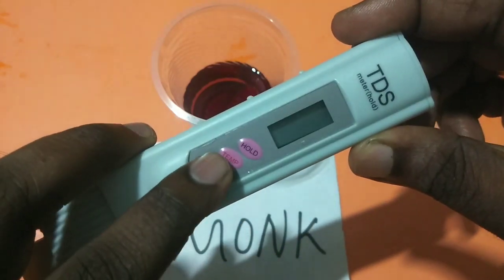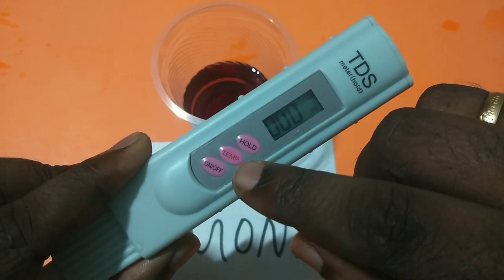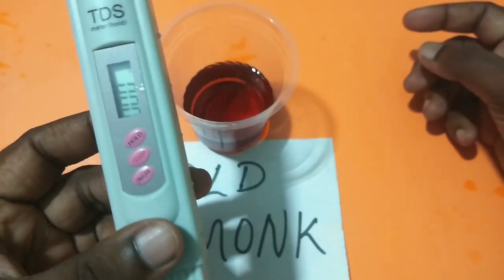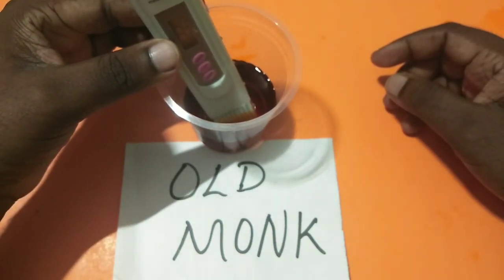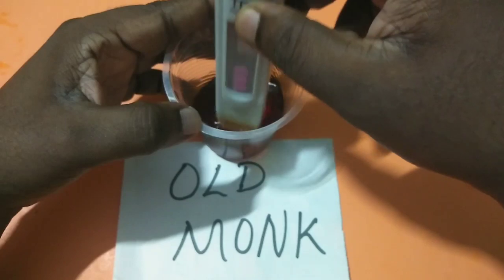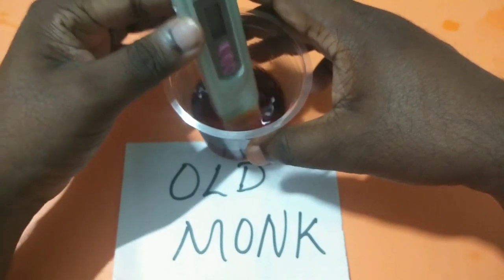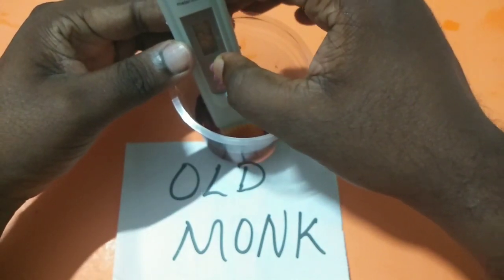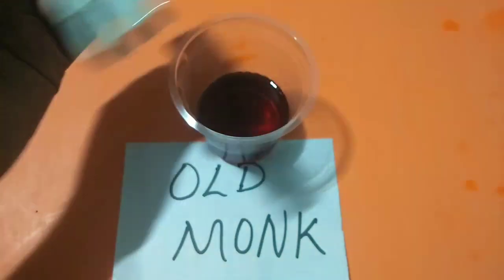So let me switch on this meter. We can use this hold button to hold the reading, and temp is actually to measure the temperature. So let me check the TDS. I can wait for a couple of seconds, then press on hold, then you can check the TDS.